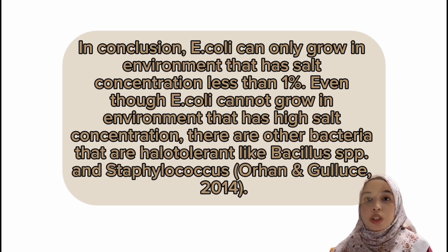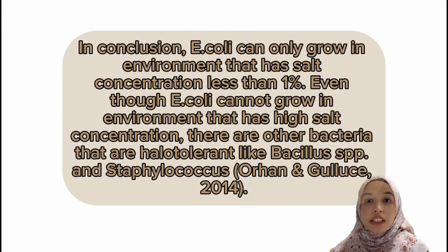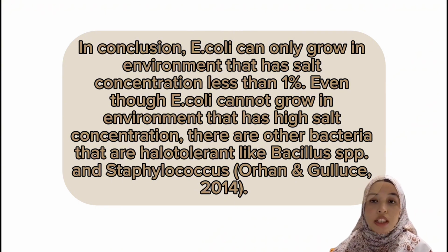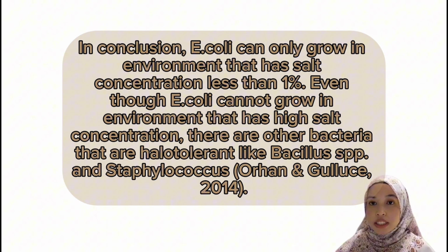But even though E. coli cannot grow in high salt concentration, there are other bacteria that are halotolerant, like Bacillus species and Staphylococcus aureus.